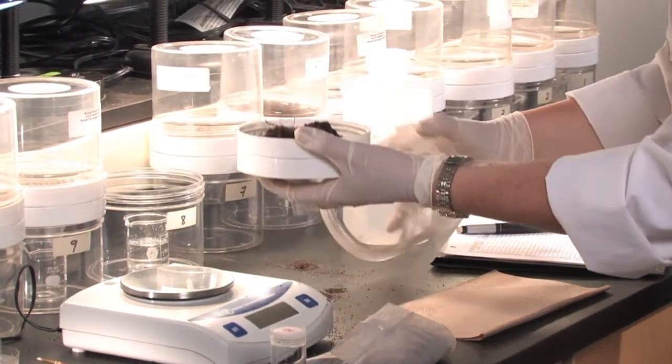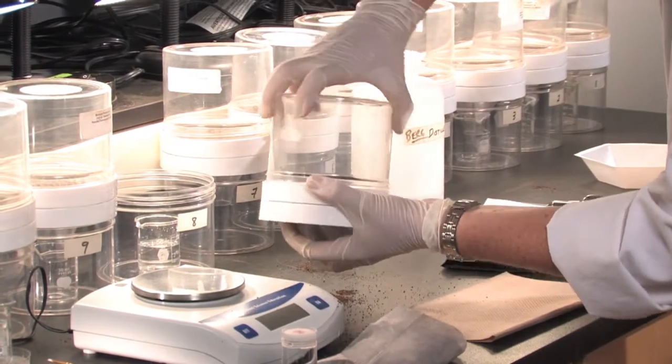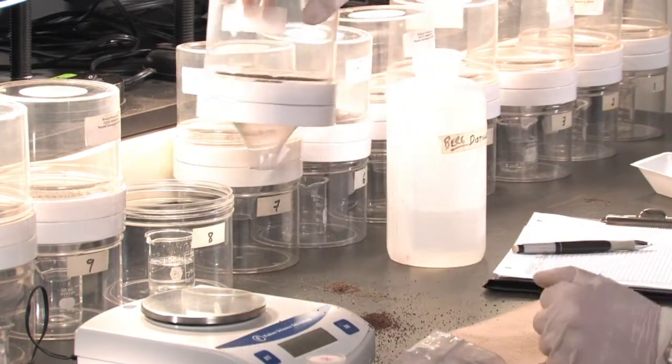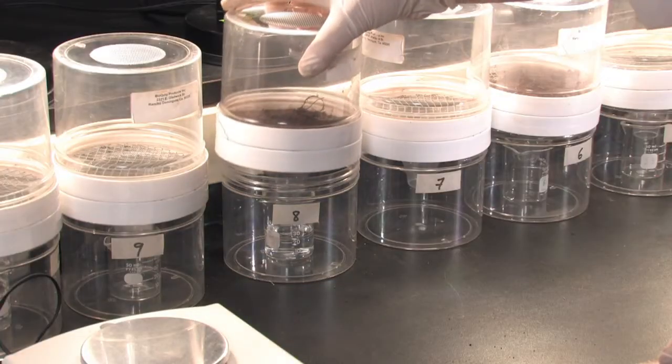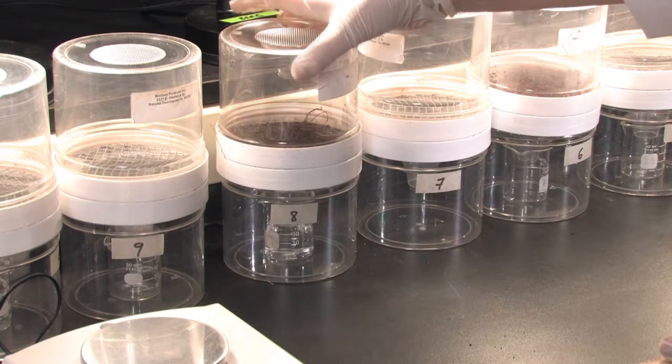Next, we place the soil sample with the covering, screw it on the Berlese funnel, and place it very carefully so that the funnel goes down into the distilled water.